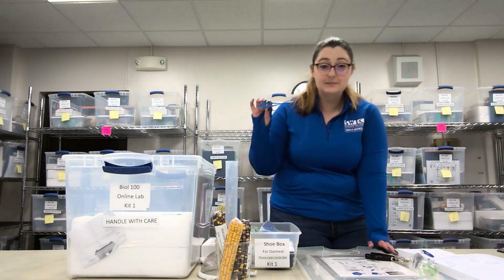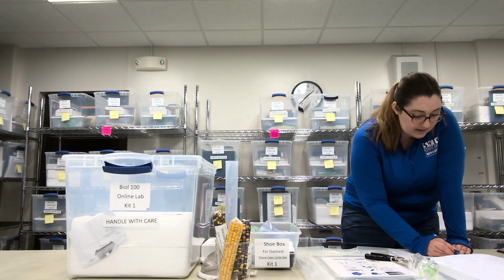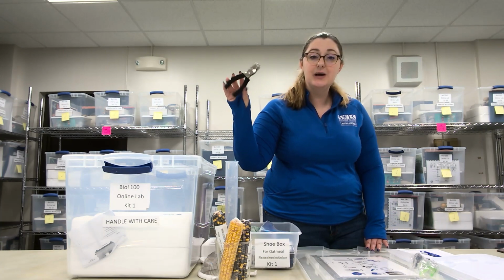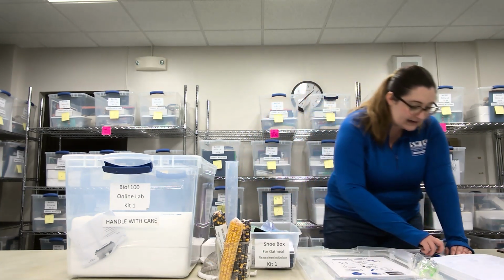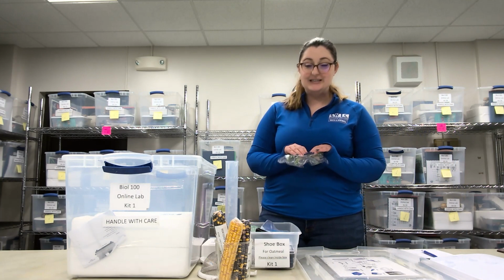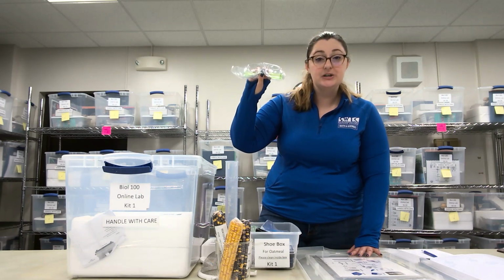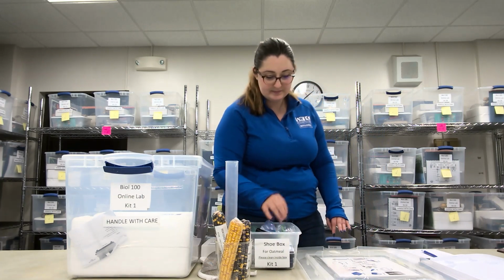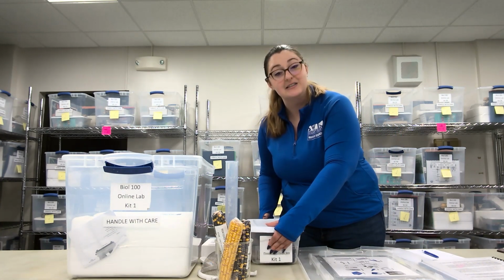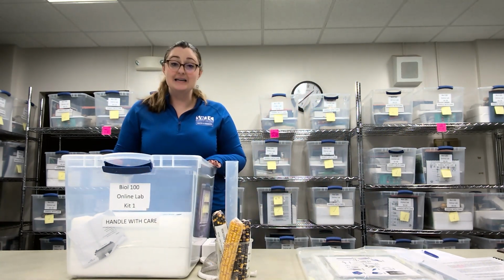Next is forceps. Those are going to be these guys. They look like tweezers. Mark that off of your list. Next is hole punch. It doesn't matter what color the handle is as long as you have a hole punch in your kit. Go back to the list, mark it off, and then we move on to the last item, which is safety goggles. This can be in a bag, they could just be loose. Just make sure that you have a pair of safety goggles. We'll put those things in there. Oh, and don't forget to check it off. And into the shoebox it goes. Everything's in there, nice and neat. And I'm going to put that back into the big box.